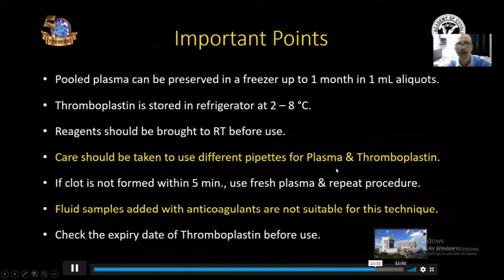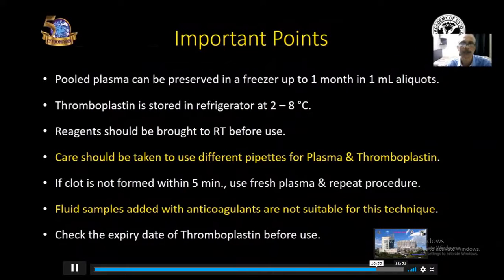Now, what are the important points? Pooled plasma can be preserved in a freezer up to one month if it is stored in one ml aliquots. At a time, one ml aliquot is used for the procedure.